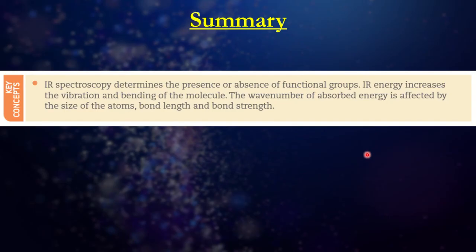And that basically concludes our lesson for today. So we went through infrared spectra, we worked out how it works, what's the science behind it. We looked at the factors that affect the different type of spectral lines that we see. We worked out that it helps us find the functional groups and the type of bonds of that. Anyhow, do remember infrared radiation is just one way of looking at the bonds and the structure of the molecule. You do need other techniques to help you round off a better picture of everything as well.